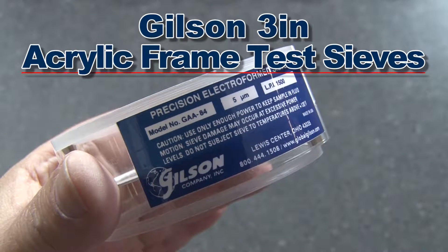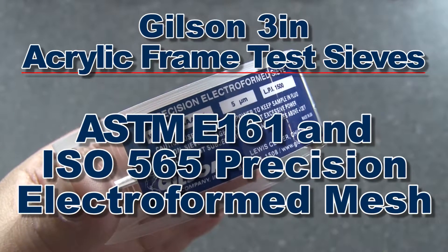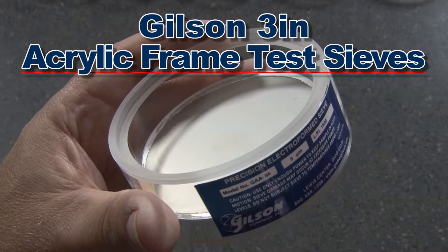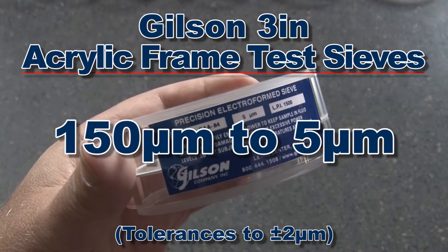The 3 inch acrylic frame test sieves are also available as ASTM E161 and ISO 565 precision electroform mesh sieves. Electroform nickel mesh openings are available from 150 microns to 5 microns.